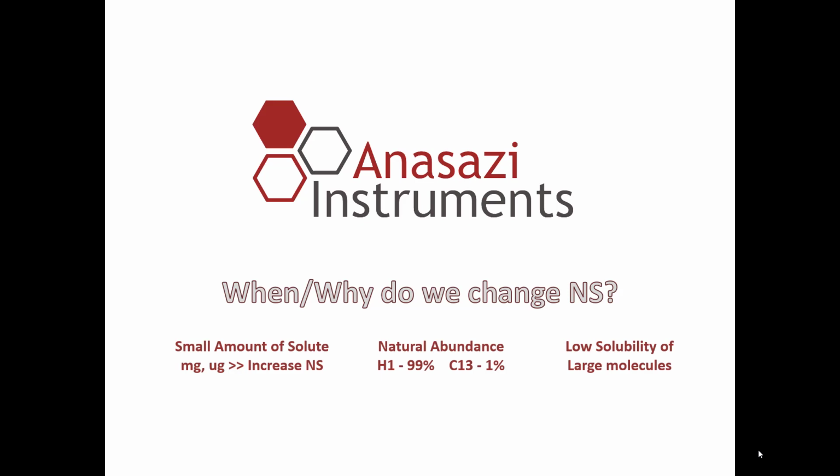Another situation is when we have large molecules, maybe biomolecules, proteins, where the molecule itself has very low solubility in a solvent, and therefore we're going to have to increase the number of scans due to the effective amount of sample in the coil.